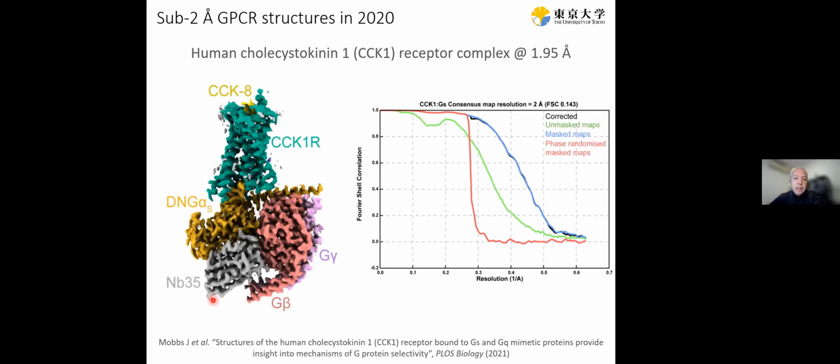And last year, indeed, we got a new microscope, the Titan G4, and it was installed in a place where there are much less external disturbances, external fields. The first machine was installed in a building where there are elevators like 15 meters away. So we had the magnetic field canceling system, but nevertheless, judging from the movement of the energy filter slit position, it seems that we have not so favorable an environment. But in the new place, it was a separate small building dedicated to microscopy.